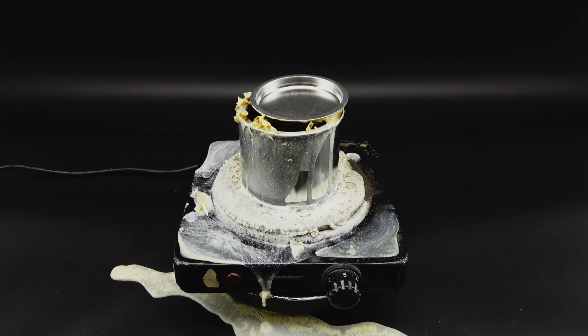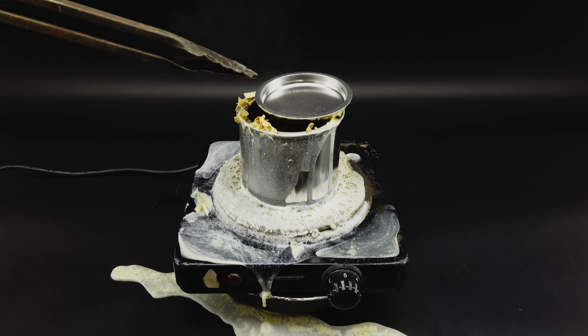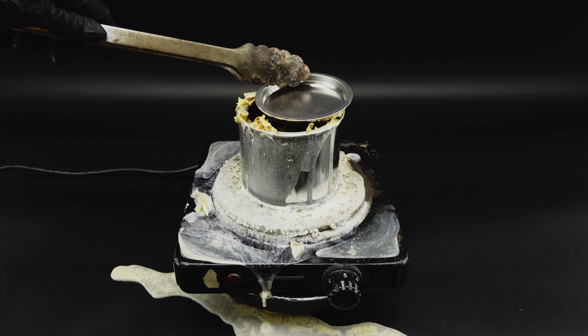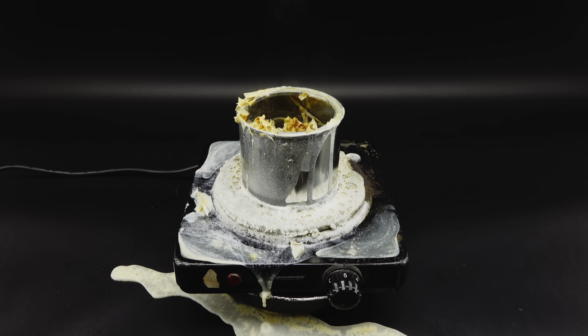Upon coming back, I nearly had a heart attack since the can apparently decided to turn into an active volcano. It turned out that it got so hot that the glycol started boiling, which resulted in pretty much the whole reaction mixture being sprayed around everywhere.